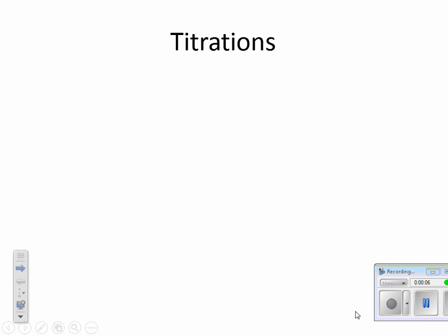Hello there, young students of chemistry. This is a short recording about acid-base stoichiometry. And generally, acid-base stoichiometry is carried out with a laboratory practice called a titration. So a couple of definitions for you to put in the old steel trap.